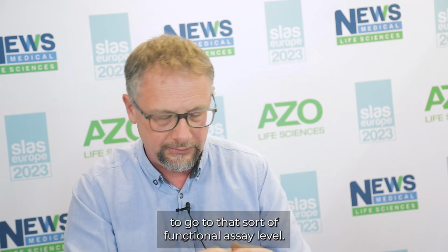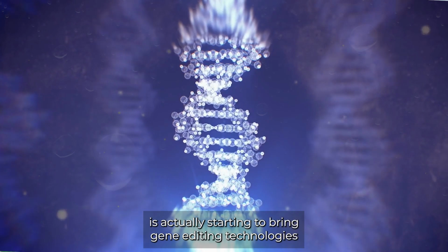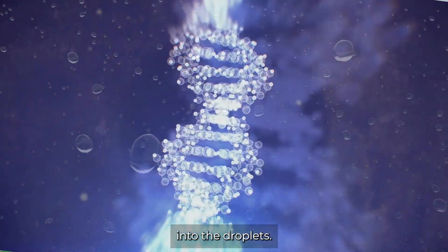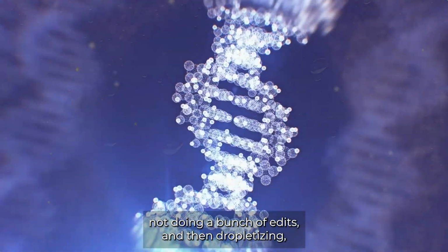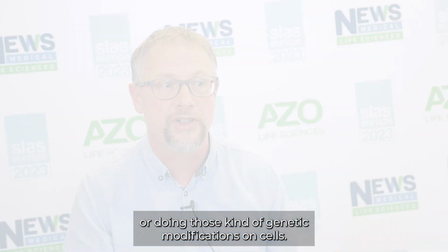A second thing we're working on quite a lot recently is starting to bring gene editing technologies into the droplets. That's doing the editing process in the droplet, not doing a bunch of edits and then dropletizing, it's actually doing it in the droplet. We've been looking at both transduction and transfection methods for doing that and getting some really interesting results: you can put a cell in a droplet, make a genetic change to that cell, and then look at the consequences and decide if that was useful or not, which opens up a whole new way of potentially screening big libraries or doing those kinds of genetic modifications on cells.